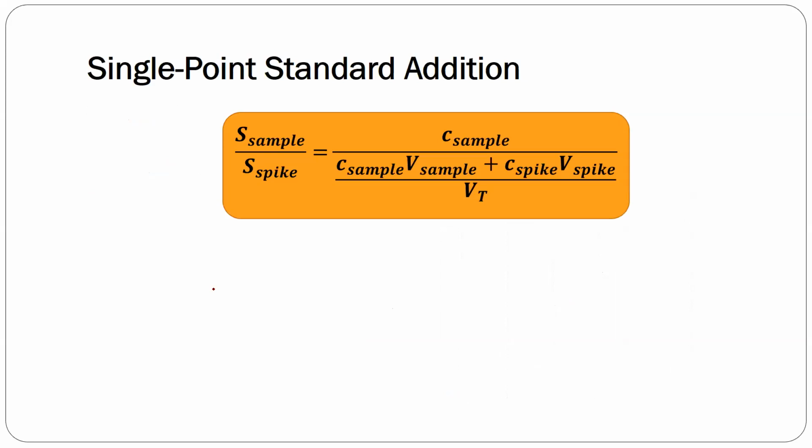And if you do that single point standard addition, medyo mapapabilis yung ating calculation. But if you do multiple points, you do it graphically, right? Mas accurate yung multiple points, of course. Pero for speedier determinations, you can go ahead and use single point standard addition. So, ang nangyayari dito is that meron ka ng signal or let's say absorbance ng sample, di ba kanina? And you also measure the signal or absorbance ng spike solution. Ibig sabihin, di ba nag-add ka ng spike? Ano yung absorbance nun? Okay?